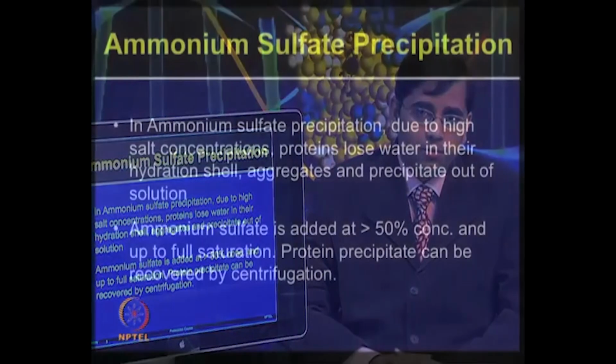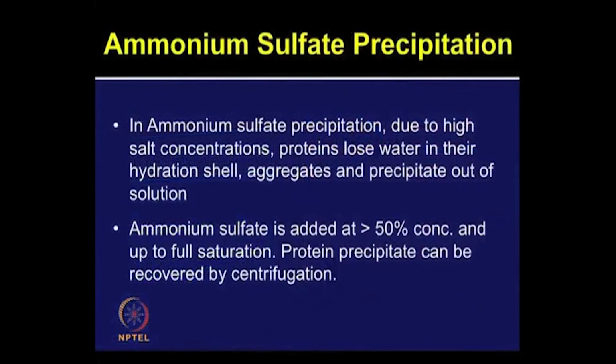So, let us talk about ammonium sulphate precipitation, which is one of the most previously used methods from the classical way of performing the experiments. Its use is not so common when you are preparing samples for proteomic application, but this one still remains a good choice.